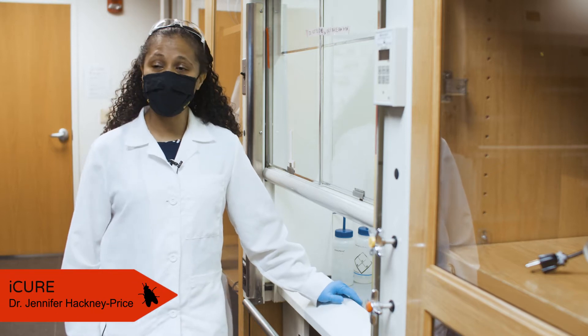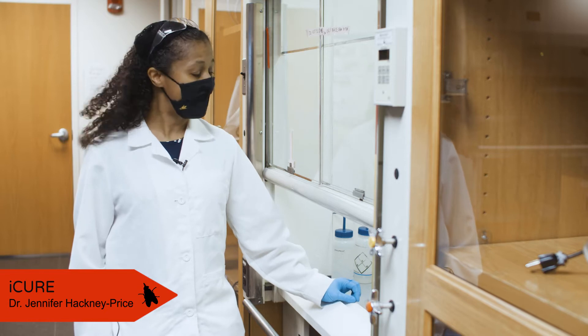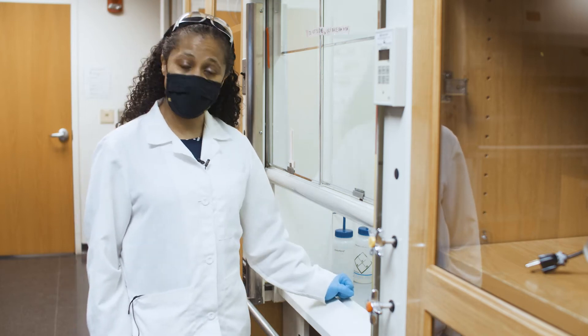Hi, my name is Jennifer Hackney Price and today I'm going to show you how to anesthetize flies and distinguish between the two sexes. This is something we routinely do in my lab and I will show you the basics of how that is done.